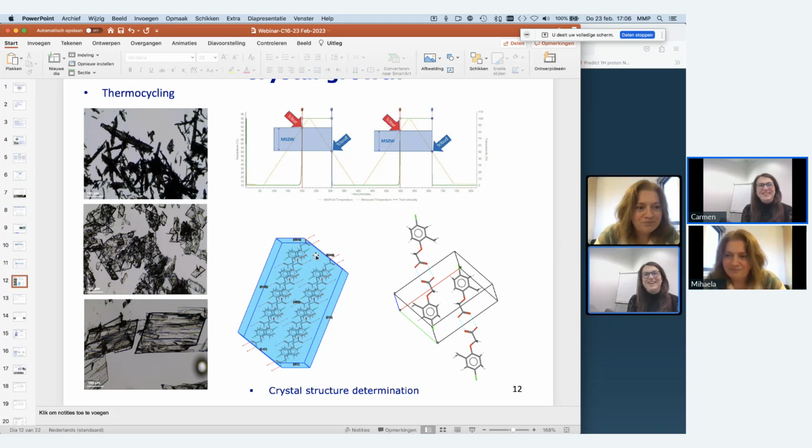Would there be a morphology change based on stirring speed changes? Have you experienced this in your experiments? On this scale, we didn't vary the stirring too much, only to make sure that there is movement, but it is too small a scale, I think. We didn't experience that it makes a difference.